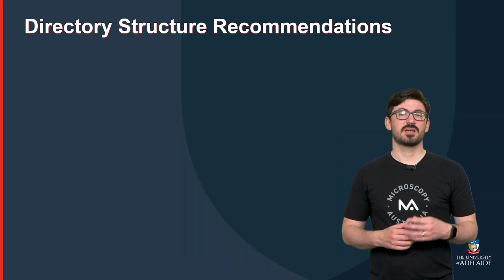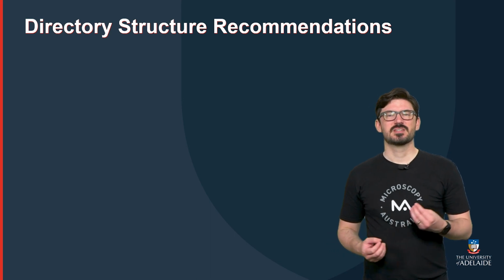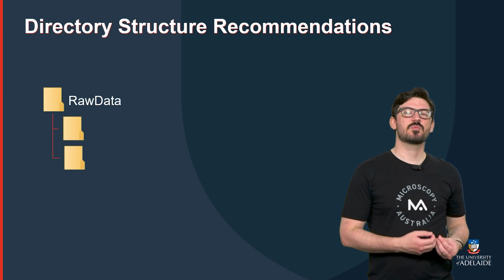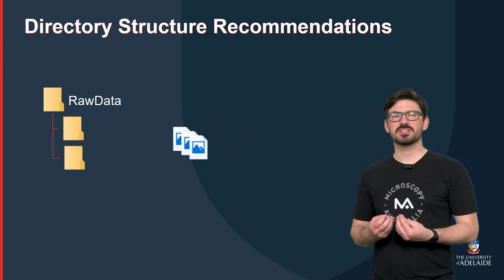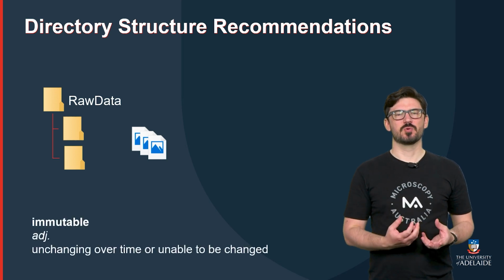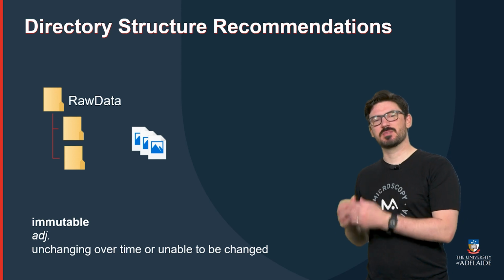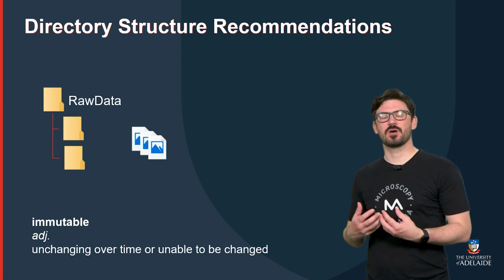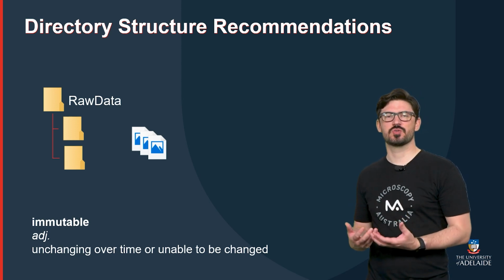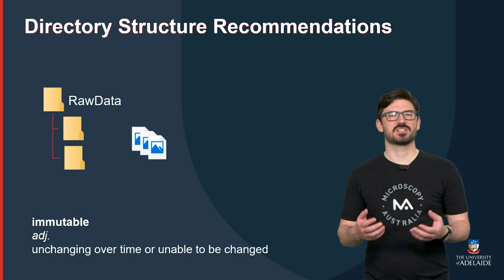In your directory and repository, I recommend that for each project, each microscope that you use, to save image files in a folder titled raw data. And it is here where you'll save the image data as it was generated from the microscope. And you should consider that data set immutable. In other words, it cannot be modified, and any subsequent image processing occurs on a copy of those files. And this just helps to comply with funder or institutional data policies, particularly when it comes to longer term storage of at least the raw data set.